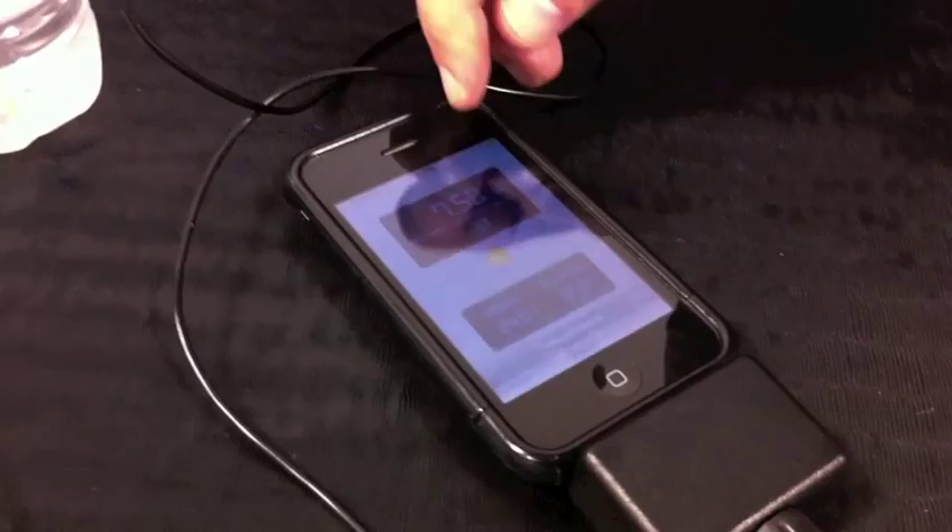It'll display in Kelvin, in Fahrenheit, whatever. But obviously with the temperature reader you get a much more accurate reading. That's right — for cases where people really need to know down to two decimal places what the PH is, they'll want to use a separate temperature probe.